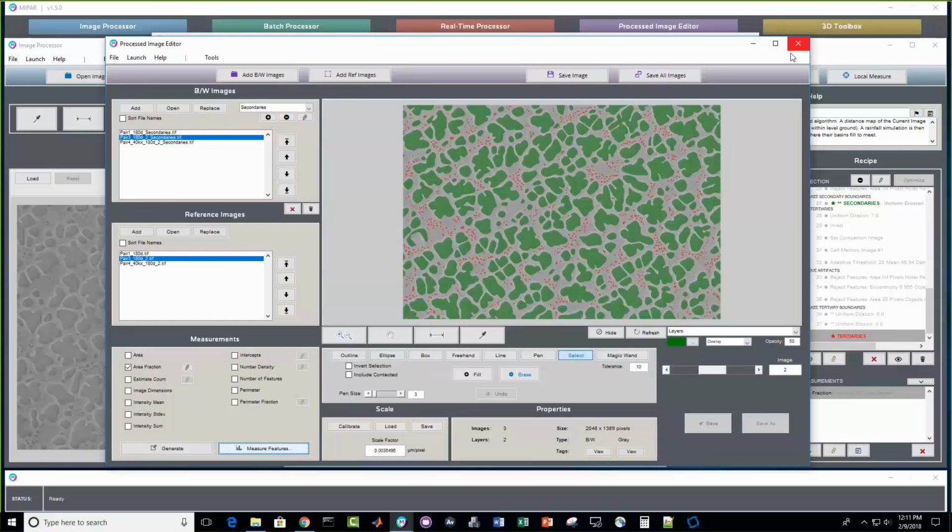Certainly, automated image analysis is facilitated by consistent and automated image acquisition. Good data in will lead to good data out. As you mentioned, in your case, the gradients and noise can evolve during acquisition. I've noted that myself in the past, working on SEMs where perhaps carbon is being deposited during scanning and is affecting your contrast, your global contrast in your sample. So I'm definitely sympathetic to some of these challenges.